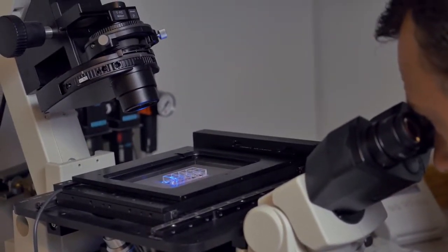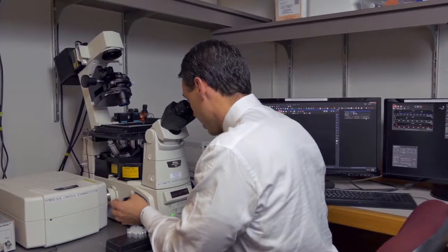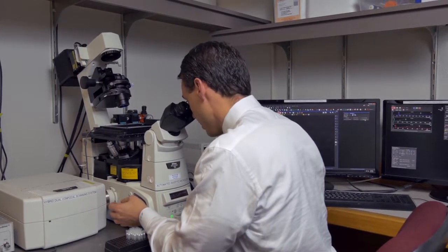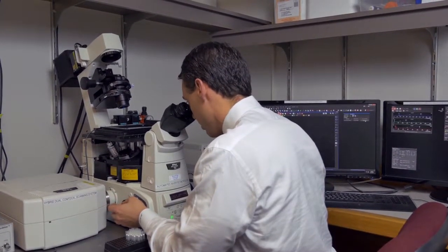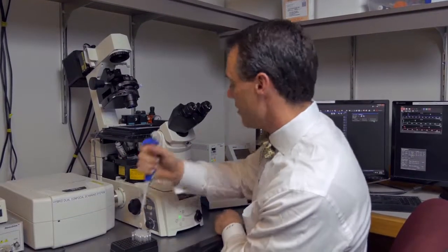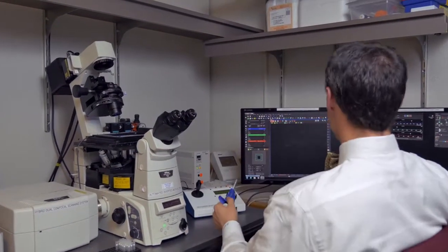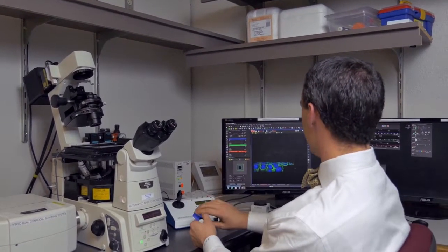What I'm actually looking at are human endothelial cells. These cells are routinely used in the biomedical space for determining numerous applications. So what I'm doing is adding a little bit of basil oil. I'll transfer the image now over to the microscope here so that you can see them.